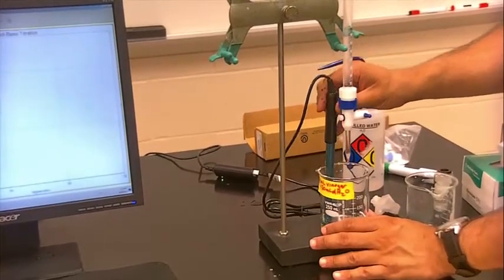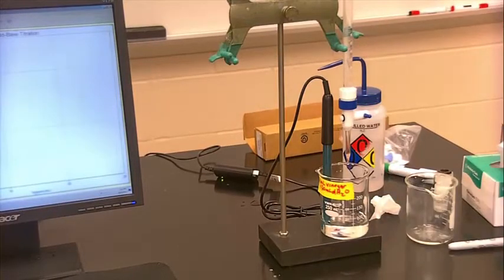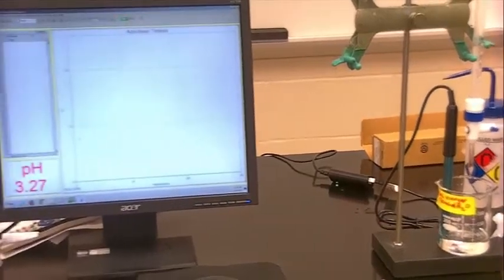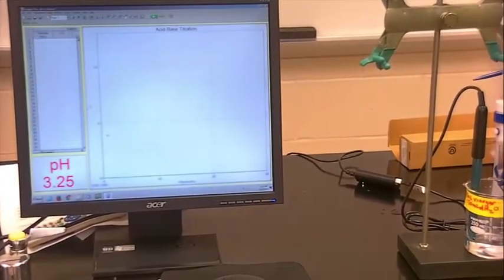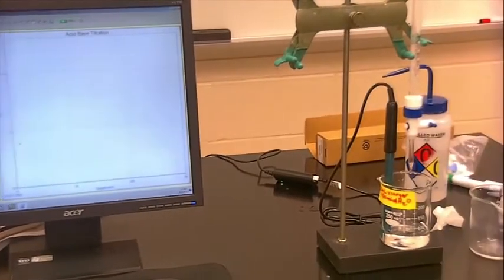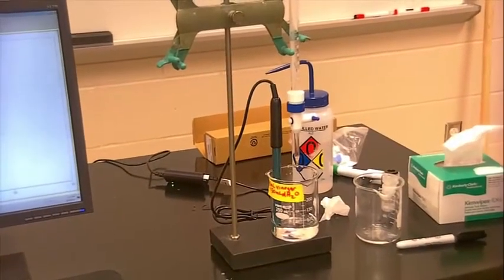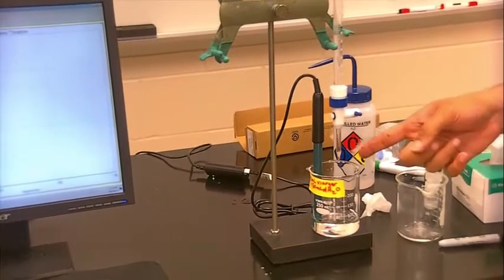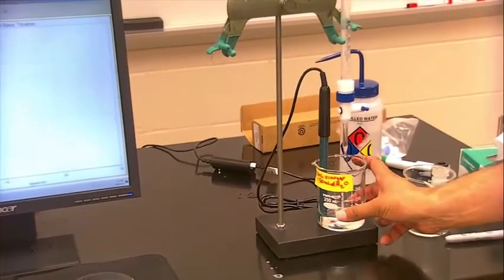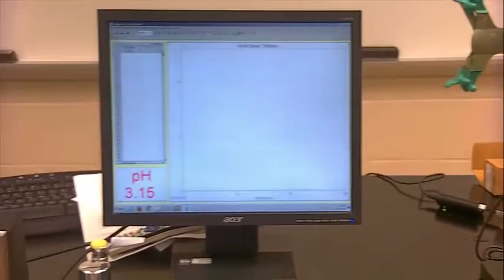You may want to clamp it on, but if you're good and maybe lucky, it could just sit right there. Okay, so now your first titration, you used phenolphthalein as an indicator for the endpoint. Your second titration, everything is the same, but you're going to determine your endpoint or your equivalence point using this pH meter. Notice how I dipped that pH meter into the solution of vinegar and water, and my pH has changed.